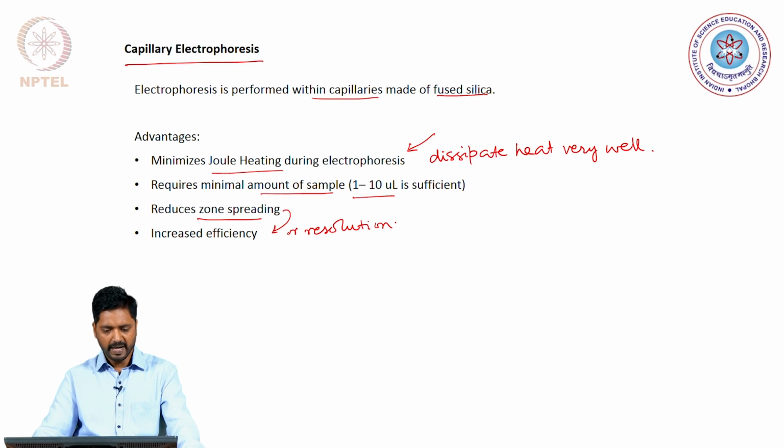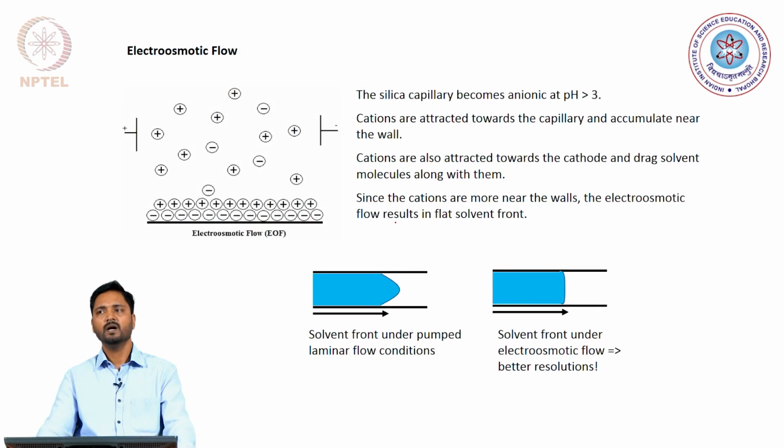Let us look at how the solvent flow happens under the electroosmotic conditions.